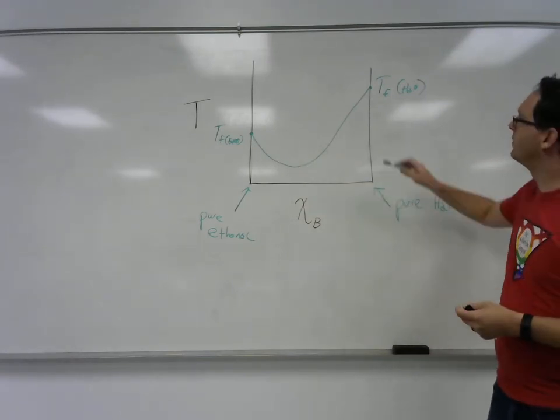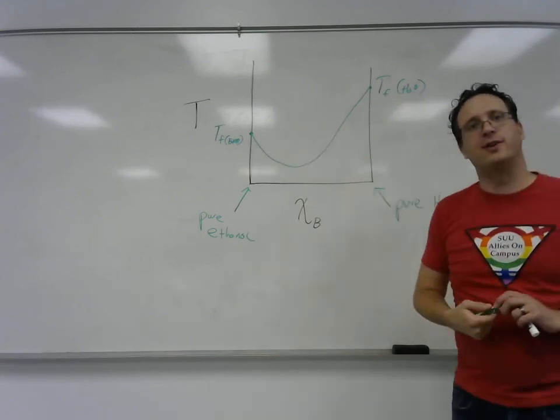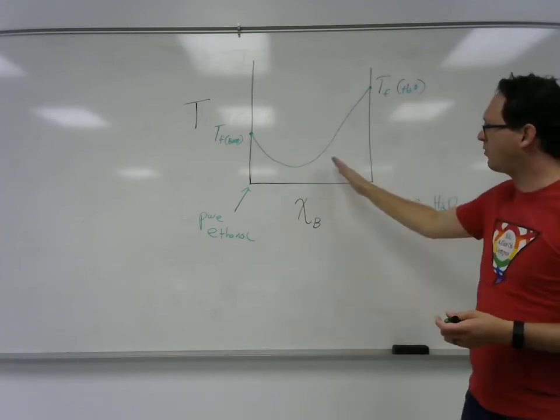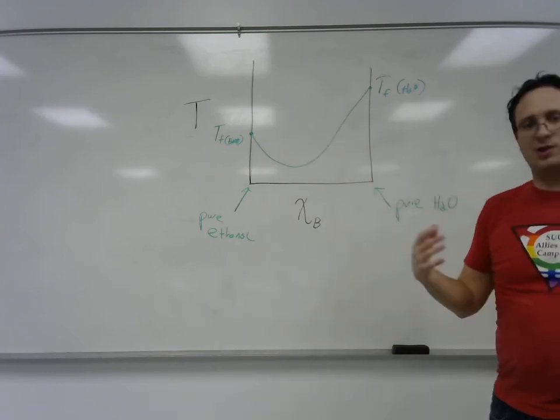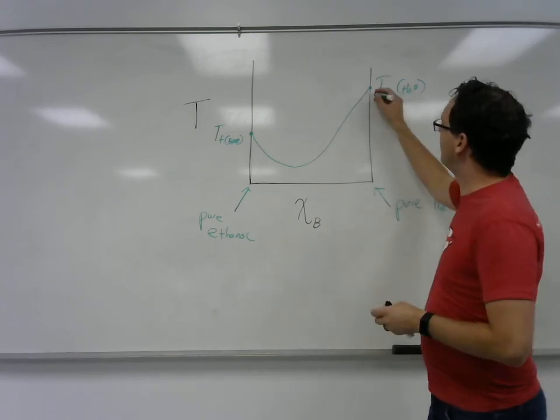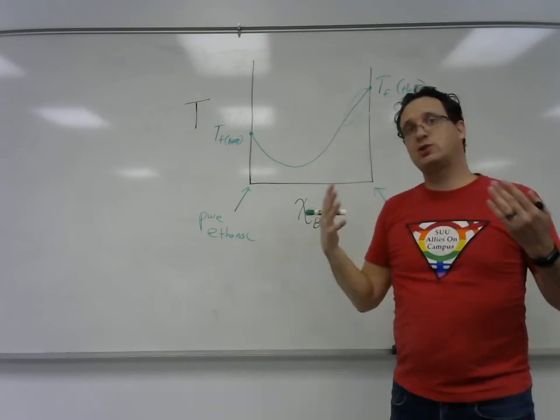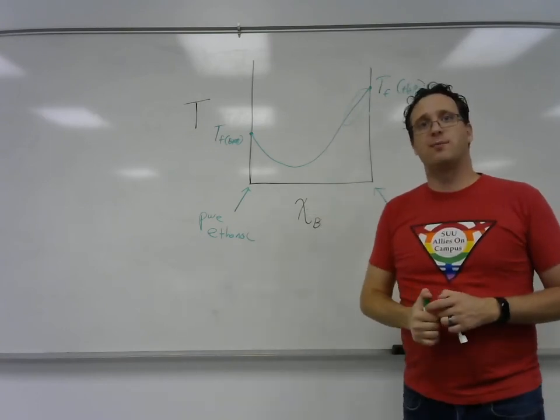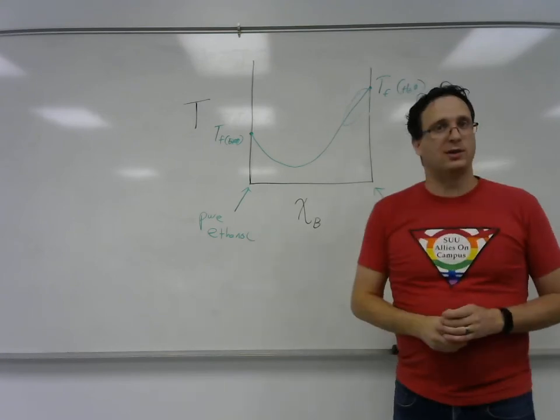And the slope of these lines is going to be related to that freezing point depression constant. Of course, somewhere in the middle we need to transition between the two of them and things get complicated. But we'll be mostly dealing with these early regions where you have mostly a pure solvent with some relatively modest amount of solute added to it.